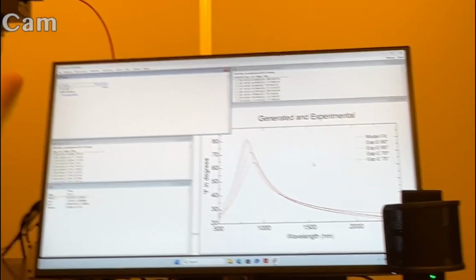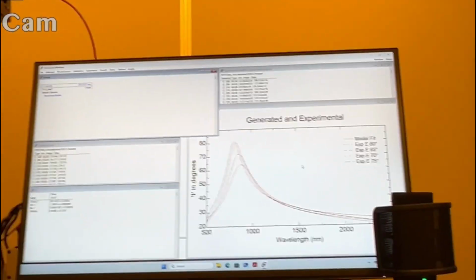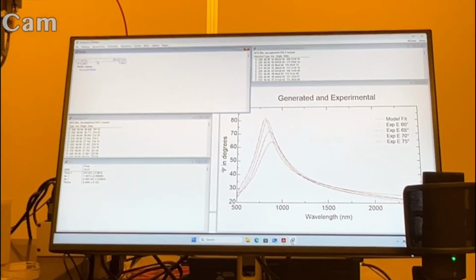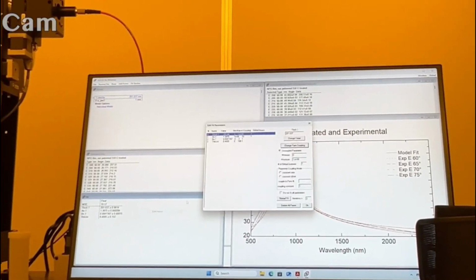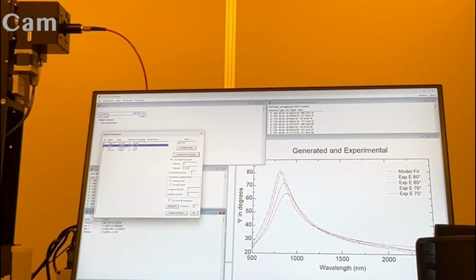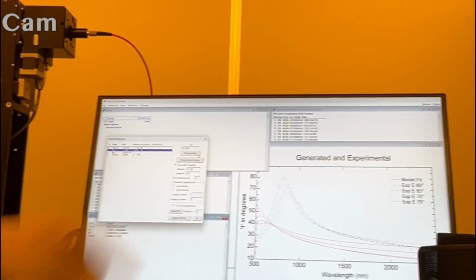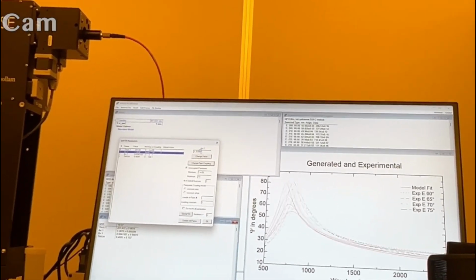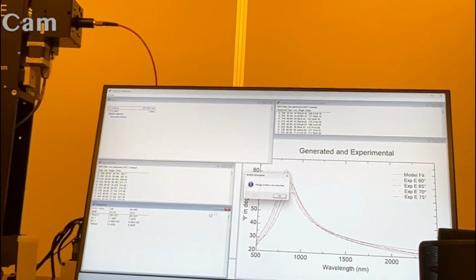We were having some problems with the films lately. Okay, so I'm not surprised. So this has a higher index. Yeah, if this were a lower index, you could see that directly. Just from a standpoint of looking at it, if this is currently at 1.38, but was really closer to 1.2, that'd really be suppressed. Especially out here where it's basically transparent, I think we're good to go.